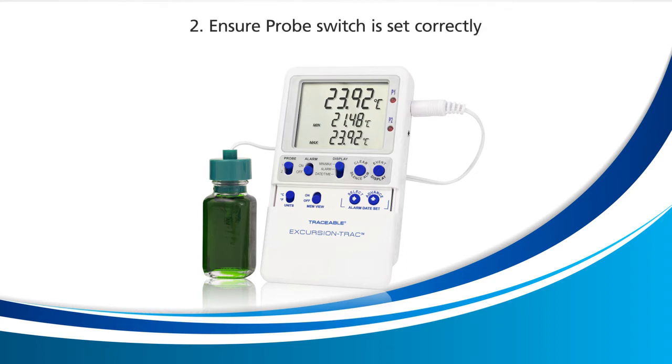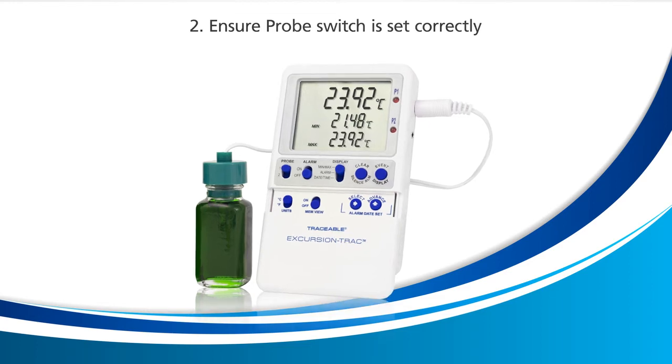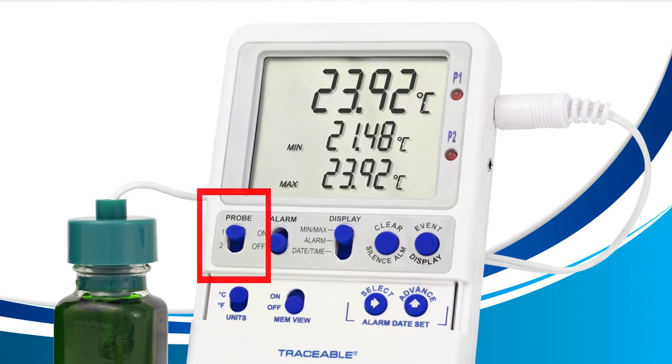If you only have one probe connected to your device, like I have here, we'll need to ensure that the probe switch on our device is set to read the correct probe. Currently, my device is set to probe 1, and it's working correctly because I have a probe connected to the probe 1 slot.